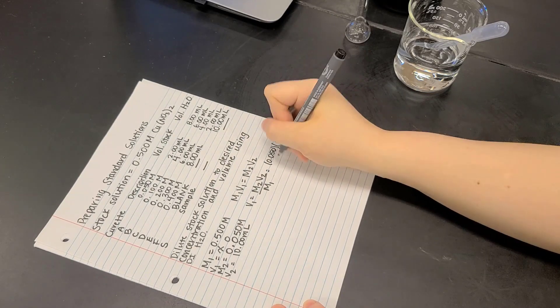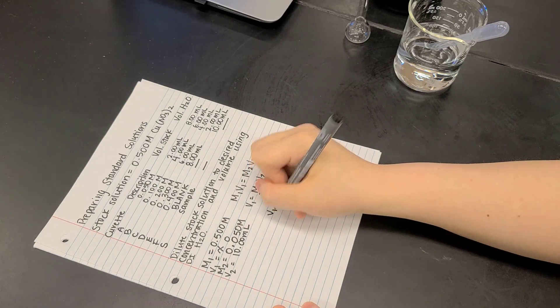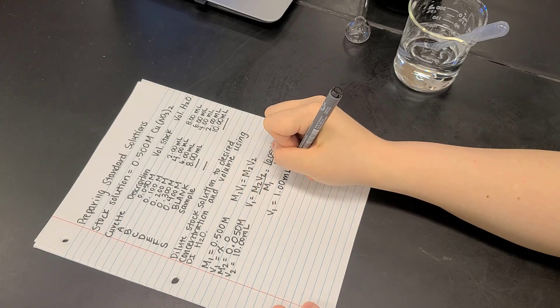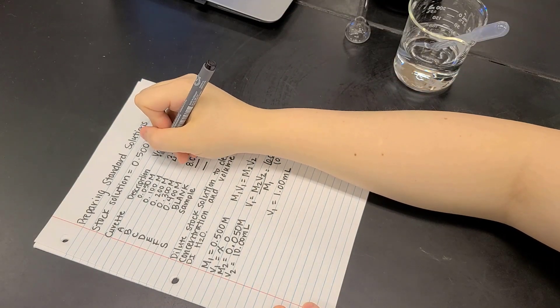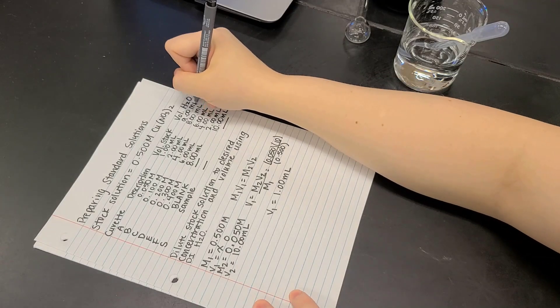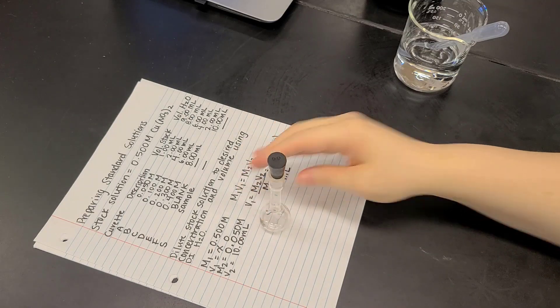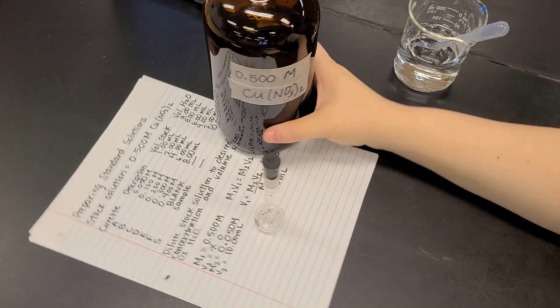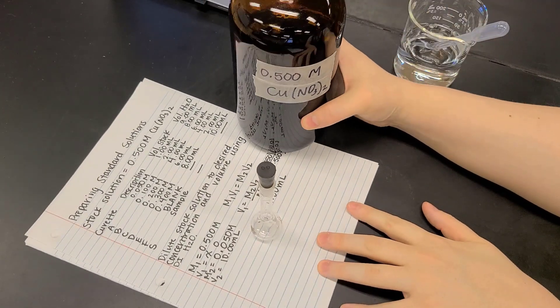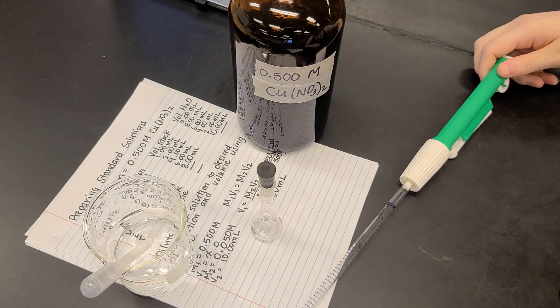We're going to measure the absorbance of all these different concentrations and produce a linear graph that will allow us to take any absorbance and determine the corresponding concentration, as long as it falls within my range of data. For example, I need 1 mL of stock solution combined with 9 mL of distilled water to make the 0.05 M solution. I repeated that calculation for all desired solutions.